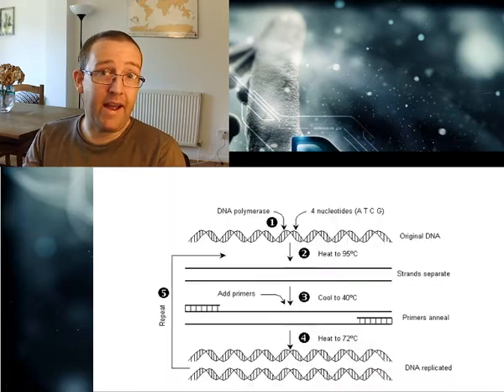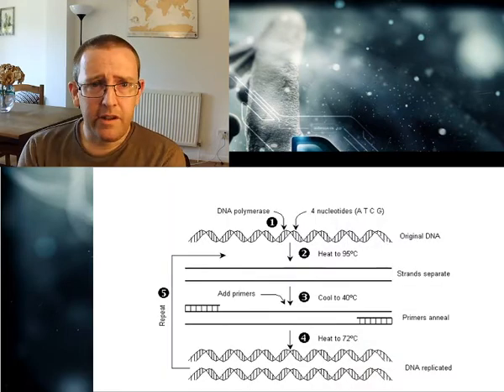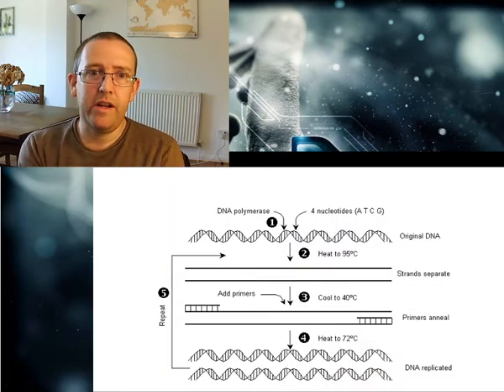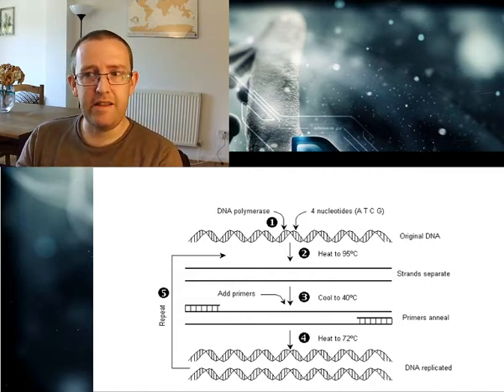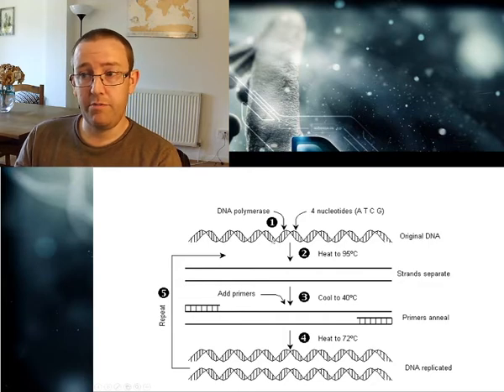Right, they're that common. So let's look at that in a little more detail about what's actually going on inside these heat cyclers. Well, initially you've got your original DNA there, which is our double helix you should be very familiar with.